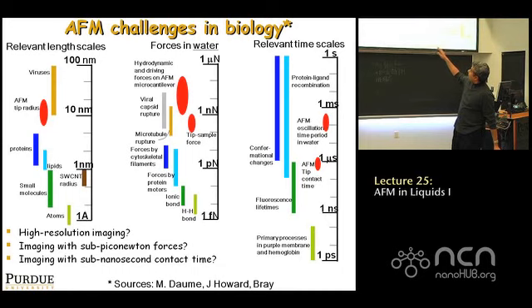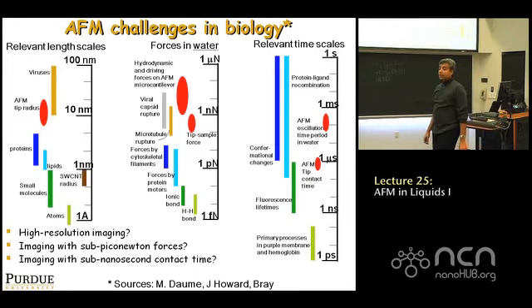At some point, you're also interested in perhaps imaging DNA or proteins, for example, and with DNA you're looking at an object whose diameter is of the order of a nanometer, right? So you're really imaging objects that change in size from a critical dimension of less than a nanometer all the way to microns if you're doing living cells. All along, of course, your tip radius is about 5 nanometers. So you can imagine that whenever you're trying to image things like DNA or proteins, you have to worry about tip convolution very much, right?